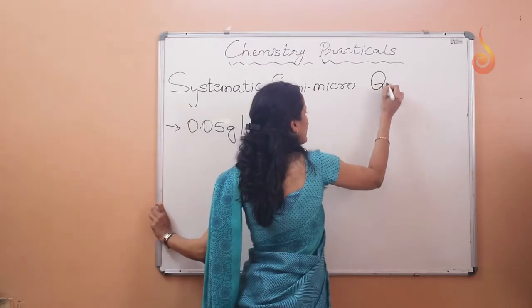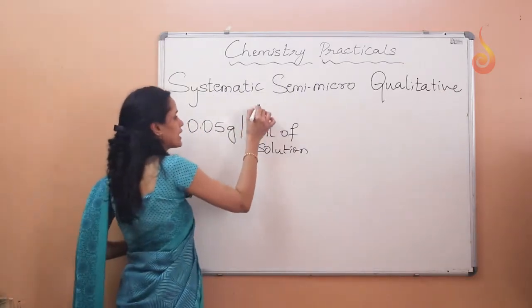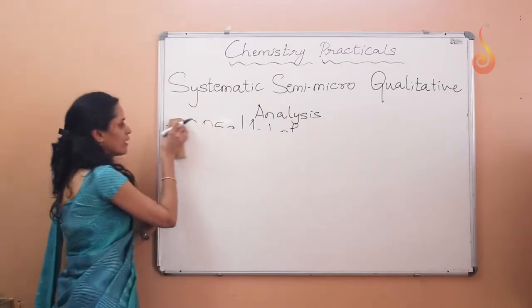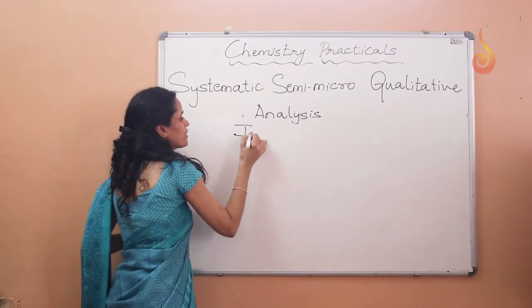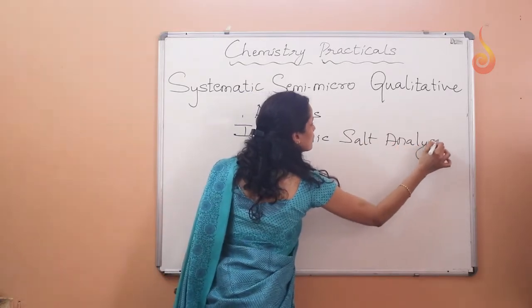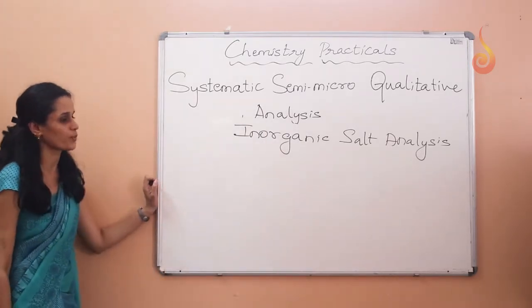And the type of analysis we are taking is qualitative. Systematic, semi-micro, qualitative analysis of which type of compound? Is it inorganic or organic? It's inorganic. So hence we say inorganic salt analysis. So this is the actual name of the experiment.